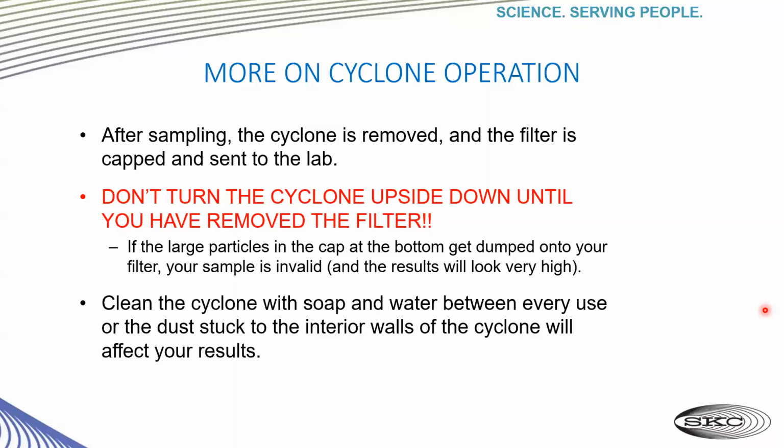Also, after the sampling, you must clean the cyclone with soap and water. Otherwise, the particles that stuck to the interior walls of the cyclone will affect your future samples and results because of the inefficiency and the effect on the operation of the cyclone.